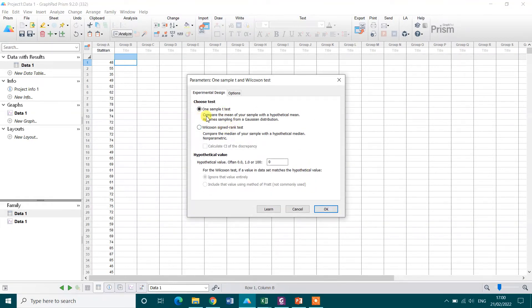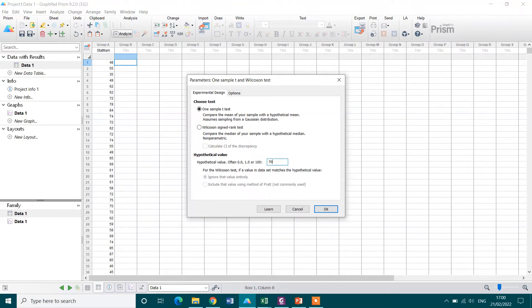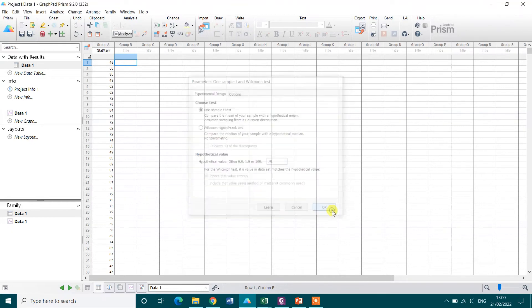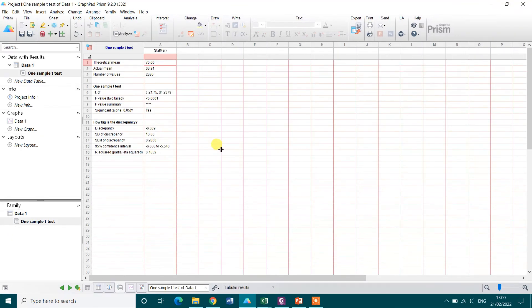I want to perform one sample t-test and my hypothetical value in this case 70, and then press OK. And this is showing my result here.